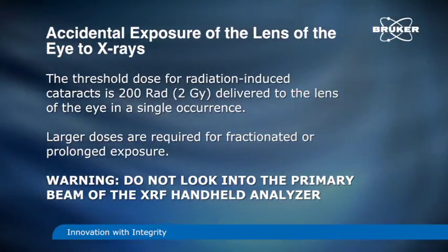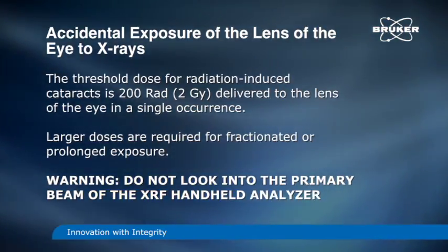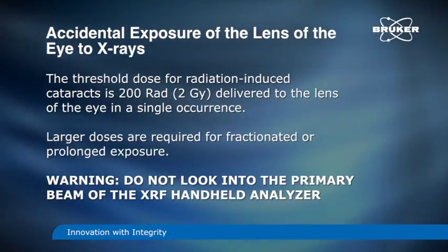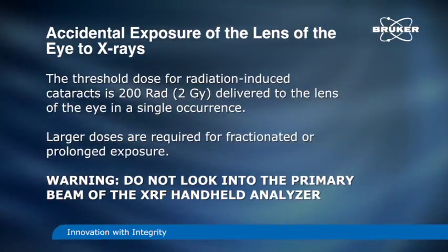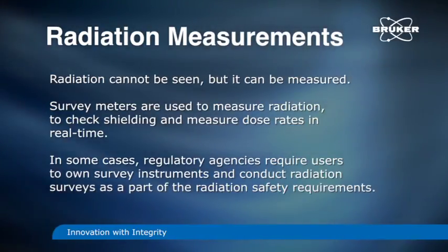Warning: do not look into the primary beam of the XRF handheld analyzer. If the unit is used in accordance with manufacturer's instructions, acute radiation effects will not occur. Radiation cannot be seen, but it can be measured.